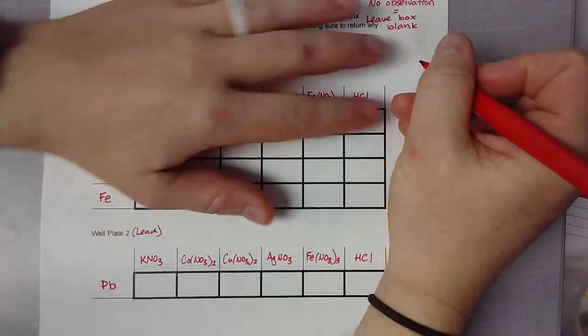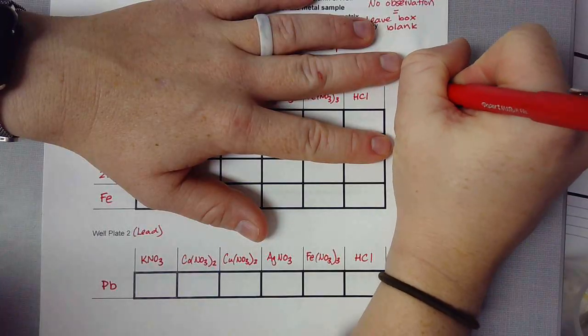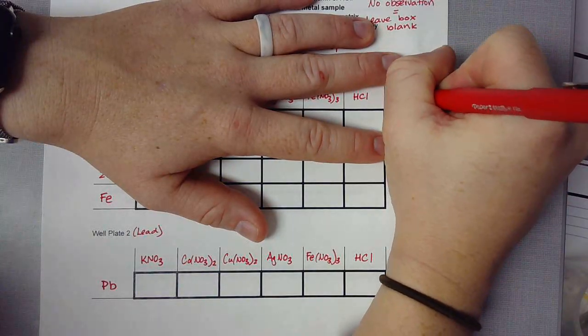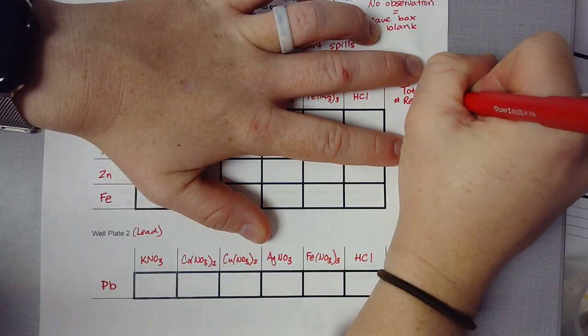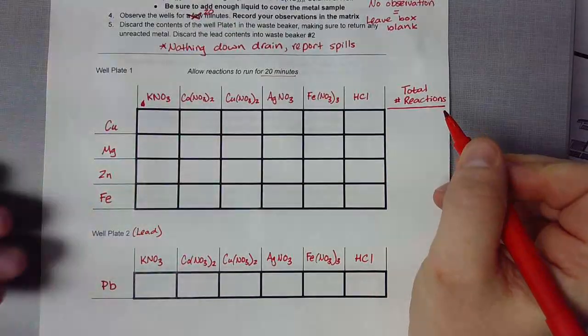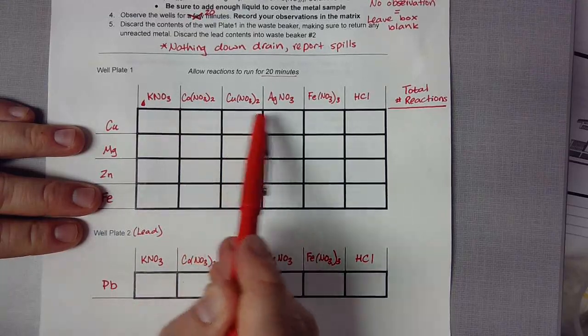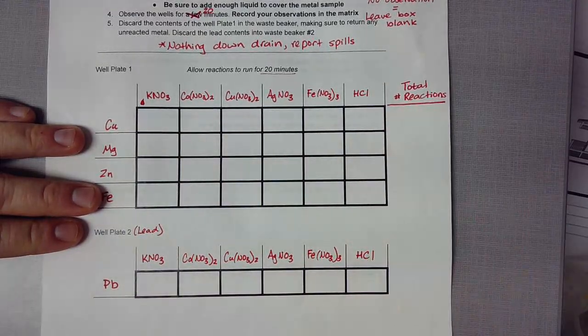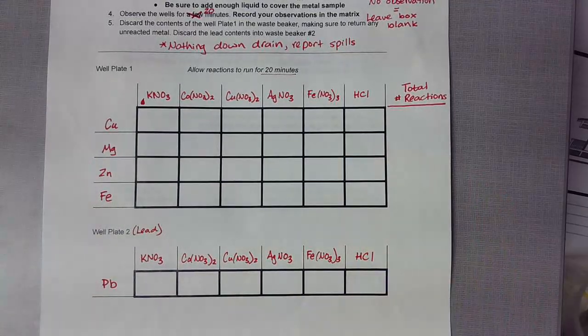At the very end of the lab, you are going to determine the total number of reactions. So it'll be somewhere between 0 and 6. If copper reacts with everything, that'd be 1, 2, 3, 4, 5, 6 reactions. If magnesium reacts with nothing, that would be 0. And that is going to be your data collection.